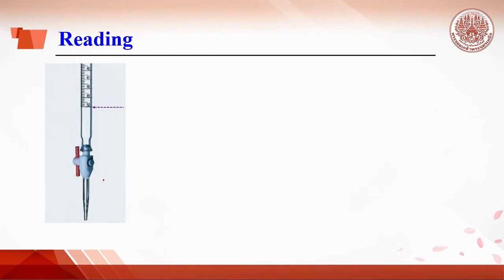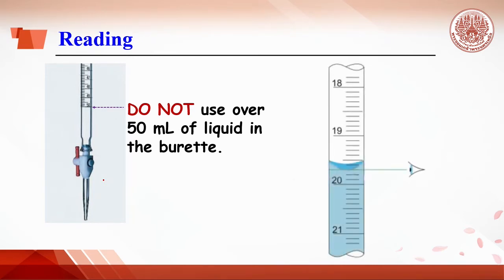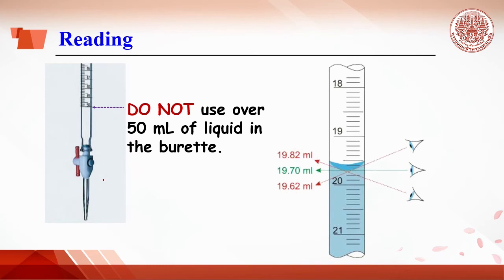It is important to note: one, do not use over 50 ml of sodium hydroxide in the burette. If more than 50 ml is needed, a refill is required. Two, read the volume from the bottom of the meniscus with the eye at the same level. If not, the result will be in error.